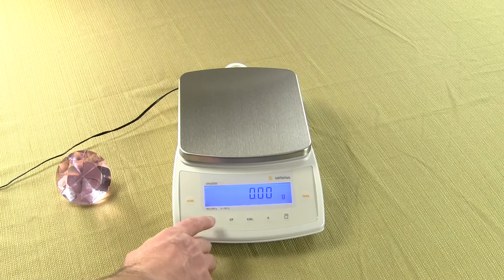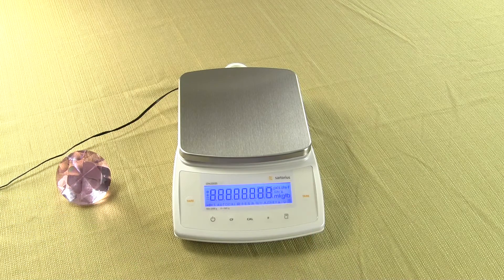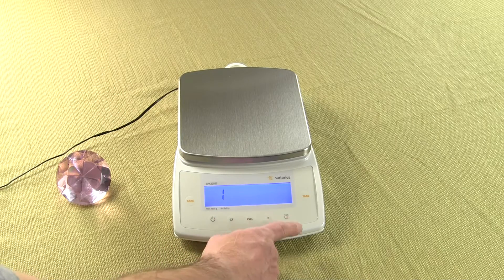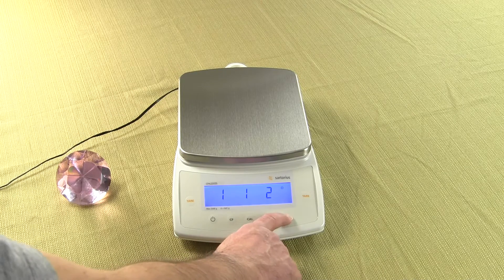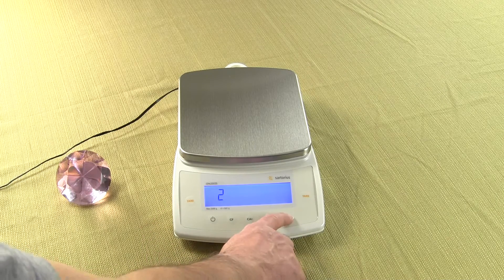To set up the application, we need to shut off the balance, turn the balance on, and press the tare key. We'll get a 1. We need to increment this — now we need to set it to 2, 1, 2. Press the Print key, then press the Cal key. So we have a 2. Press the Print key.